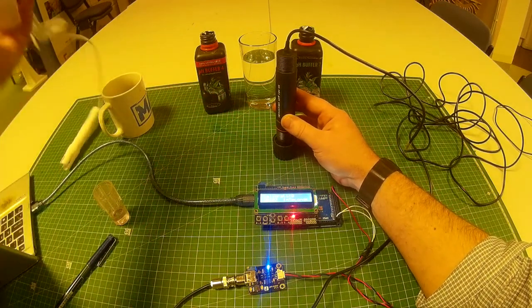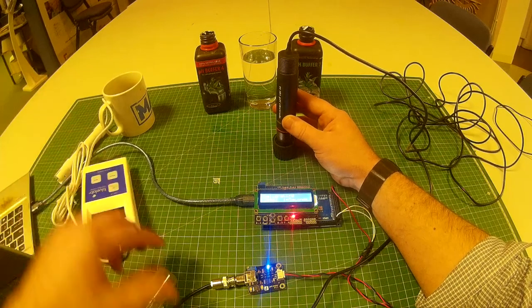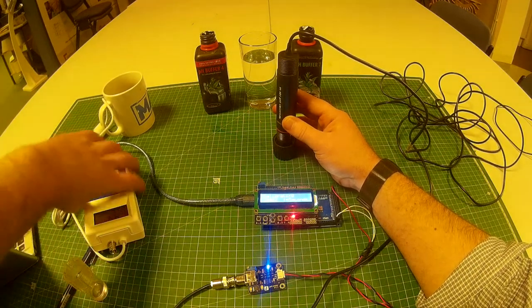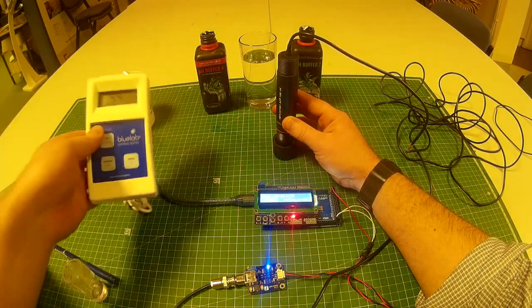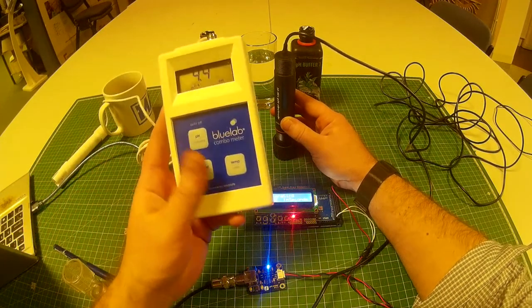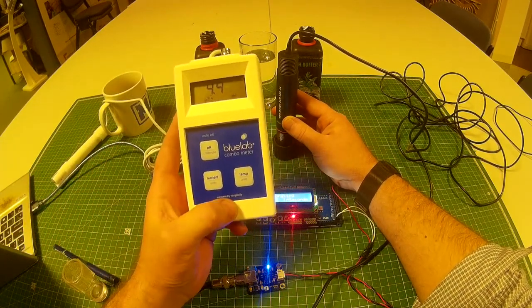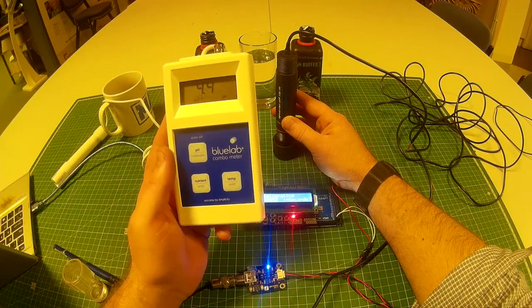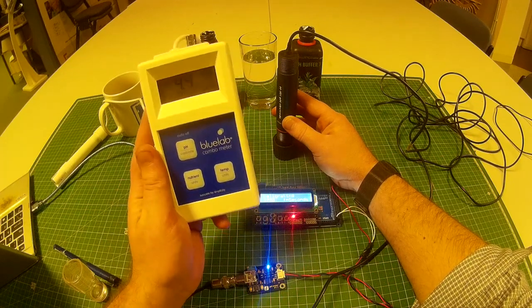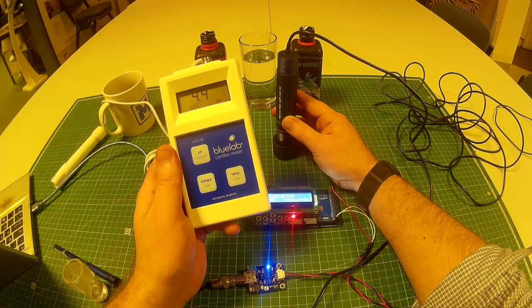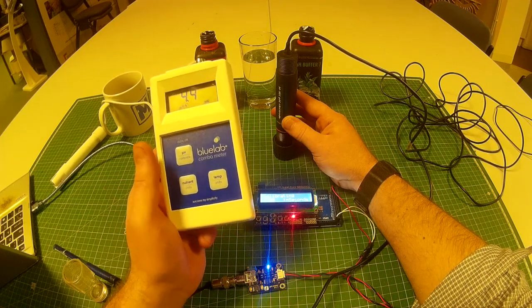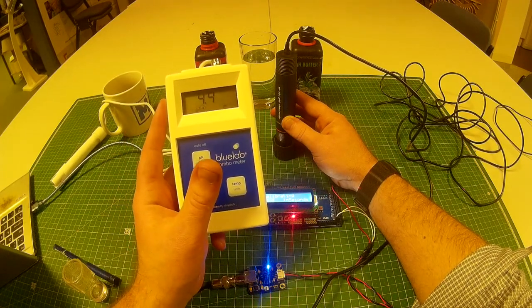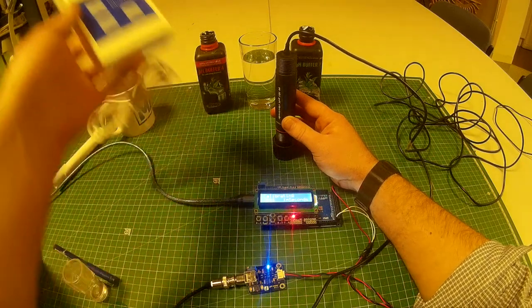Just while we've got a bit of time now actually, I'll talk about how accurate it is. This is quite an expensive pH meter from Blue Labs. And in comparison they show the same results, just as accurate. This doesn't have the capabilities for testing probe health unfortunately.